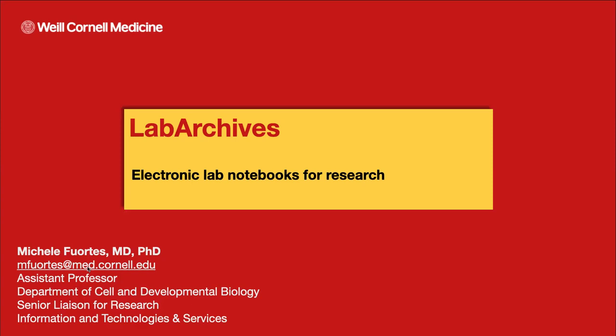And I've been giving a lot of these presentations also to individual labs. So if you want to organize a presentation of LabArchives for your lab, just let me know, and I'll be glad to come to your lab meeting and set it up and make sure everybody is comfortable with using it.